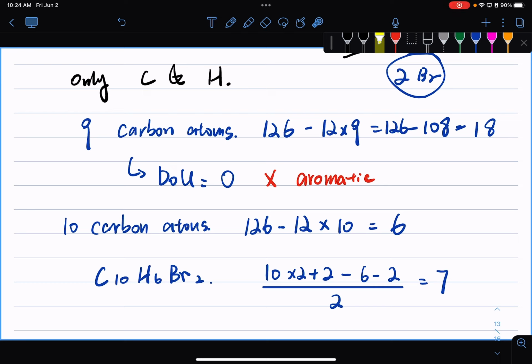All right, so we do that by first working out what the isotopes are, what the halogens are in this molecule, and then we work out the potential degree of unsaturation in these candidates. We know it's aromatic, so we have some degree of unsaturation, and that's how we get the molecular formula here. Yes?